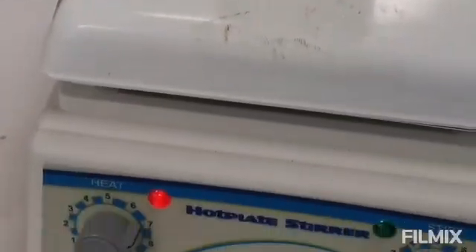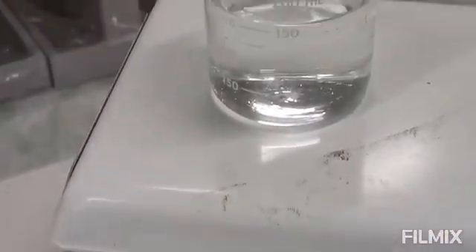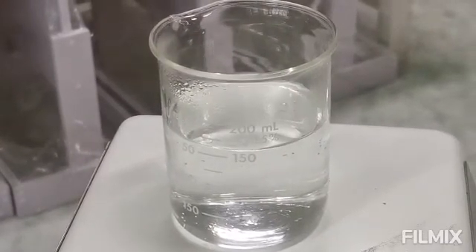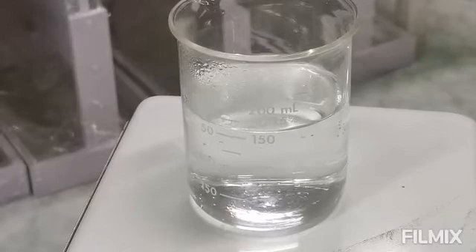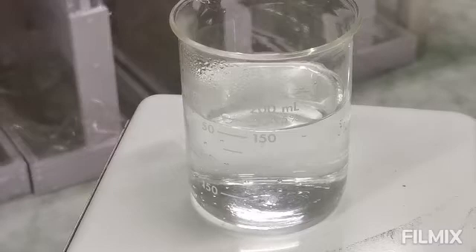You have here your hot plate, heating a beaker containing water, serving as your double boiler. Our next experiment is actually to test the reaction of heat to the different protein.